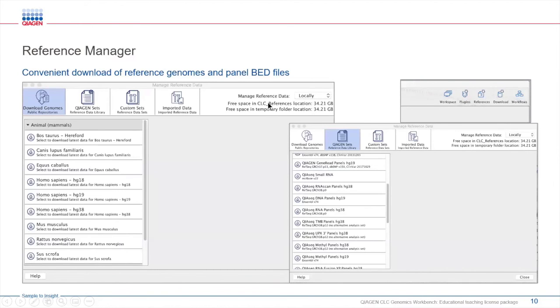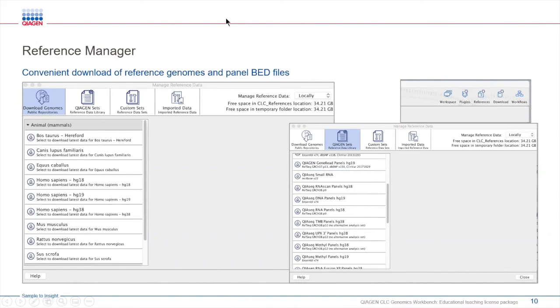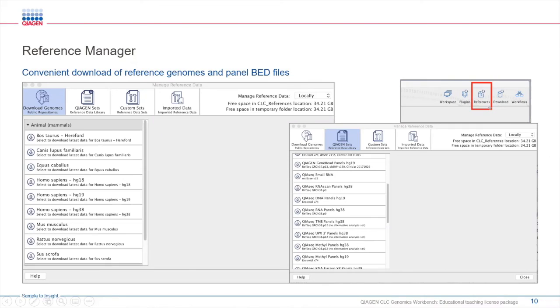When it comes to references, CLC offers an easy management of reference data within the workbench. The reference data manager, which is located on the upper right-hand side of the workbench, provides tools for downloading and managing reference data for use with analysis and workflows.